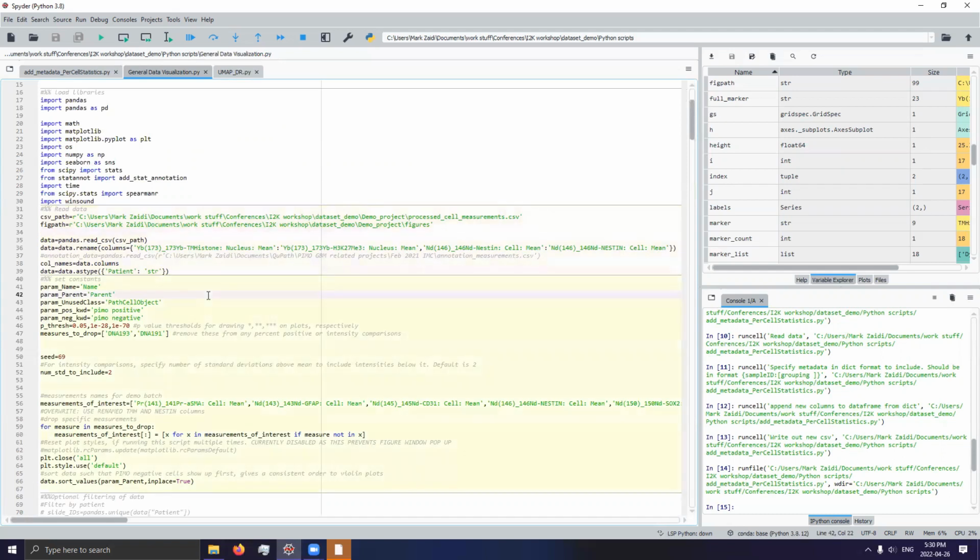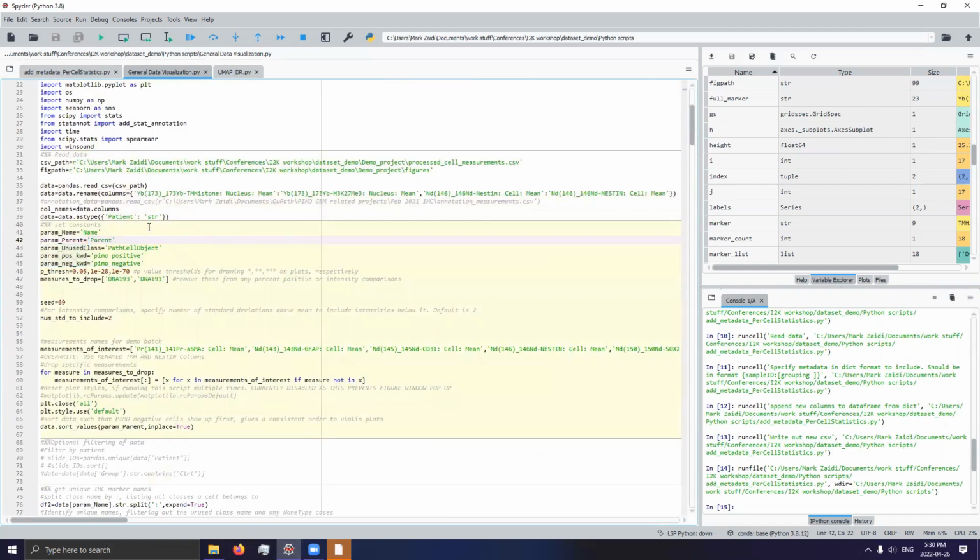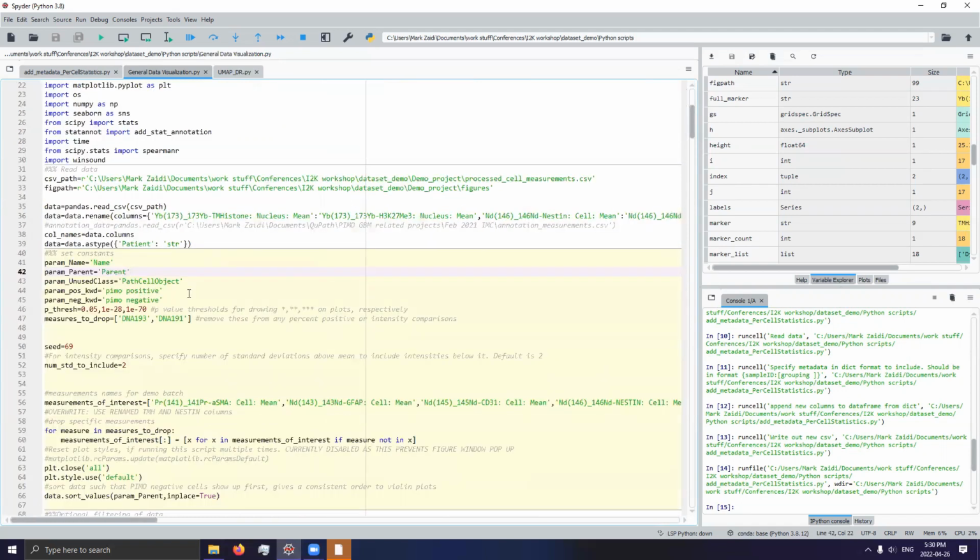Next up, we have to set some constants. Now, I can't really go into a lot of detail about what each constant does until I actually encounter use of that constant down the line. But this is basically a way of saying what columns we would want to pass into the subsequent functions for plotting the data.